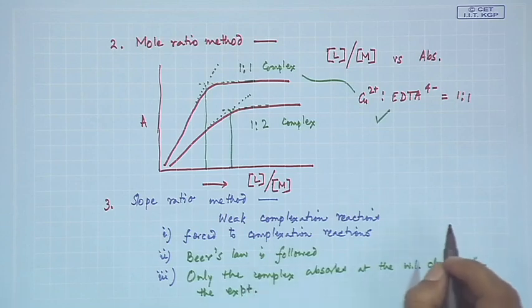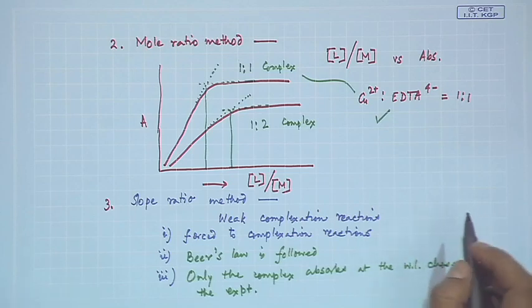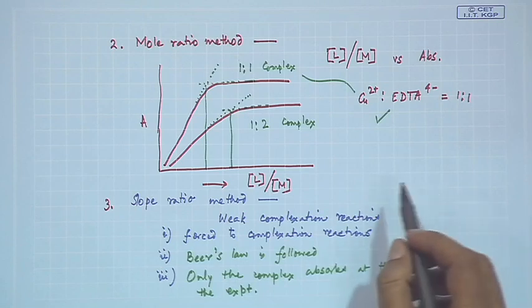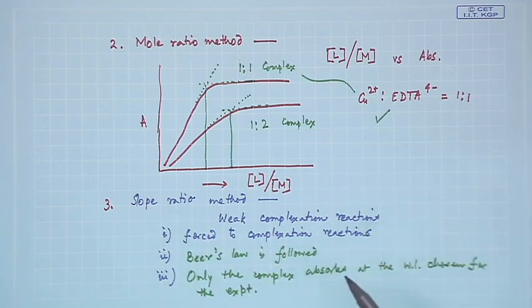So, these are the things on how we can monitor and use all these complexation reactions from the different methods. We can utilize them, and photometric titrations, the identification, as well as the determination of the corresponding Kf values are also useful in all these cases.